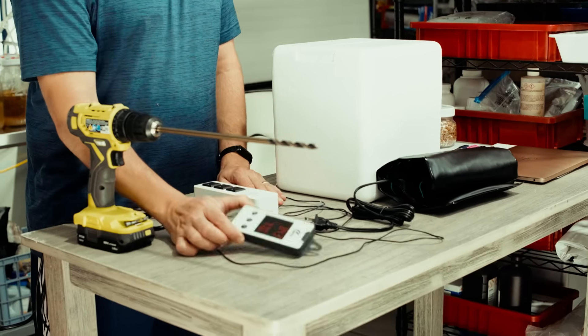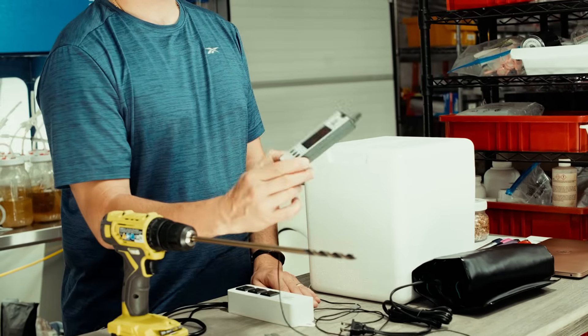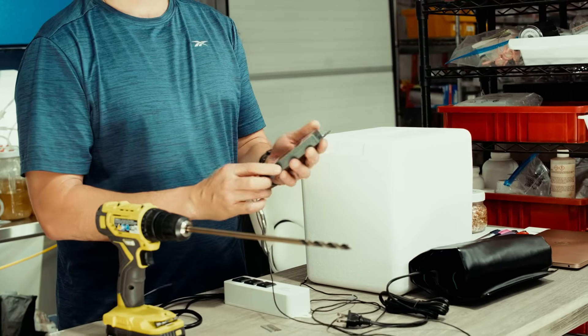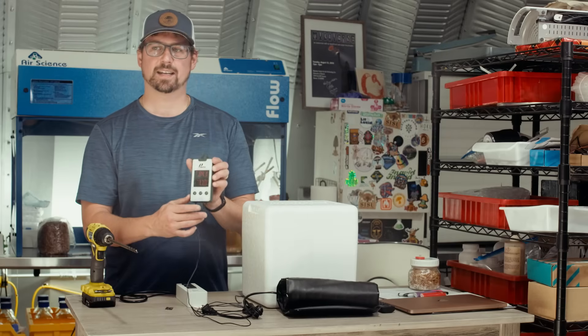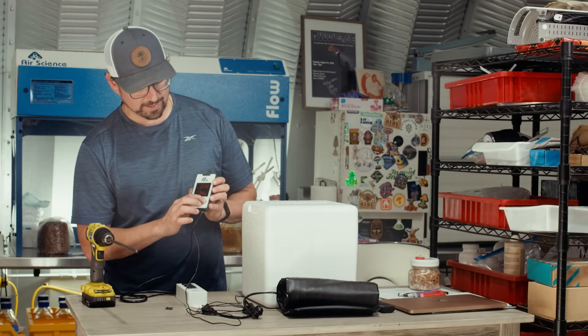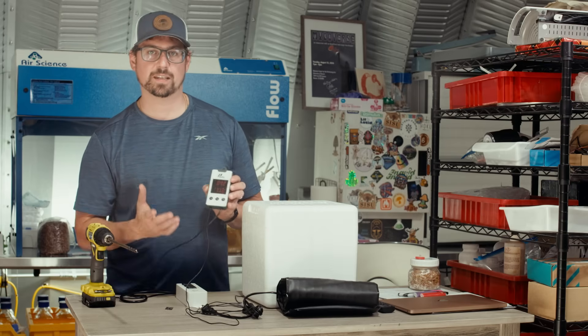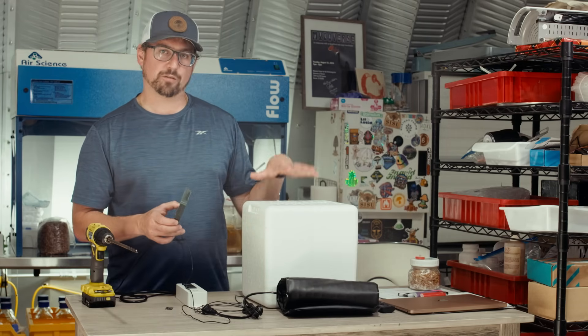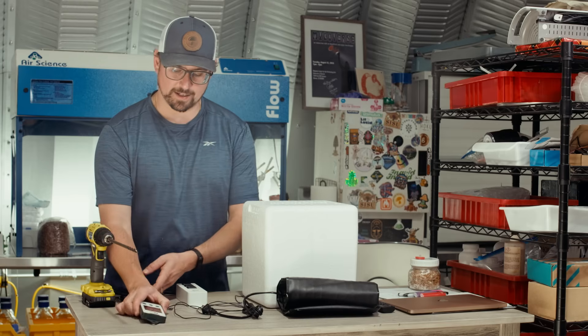The next thing you need is a thermostat. I like these digital thermostats — there are also Inkbirds. This is a Pawnee brand I was gifted for free. Ideally you want the capability to change temperatures easily, as the temperature will fluctuate when cultures are growing inside.